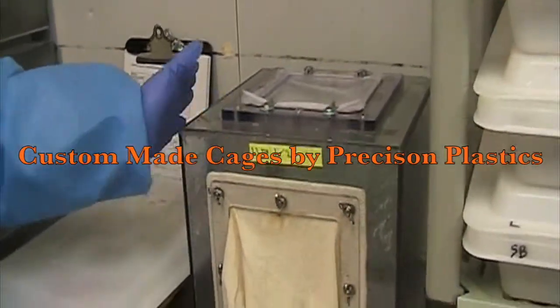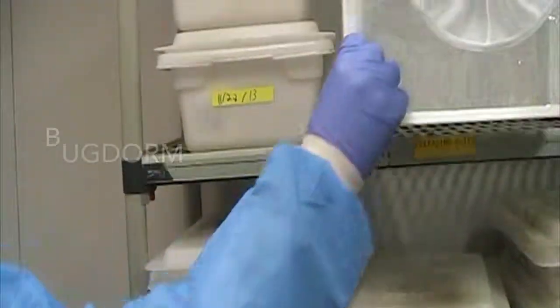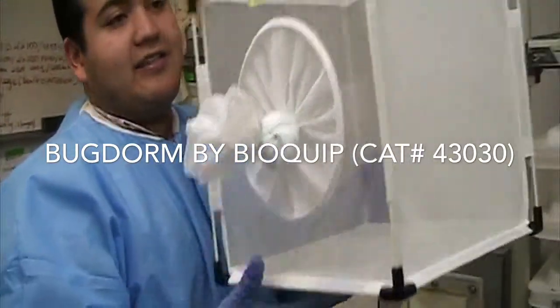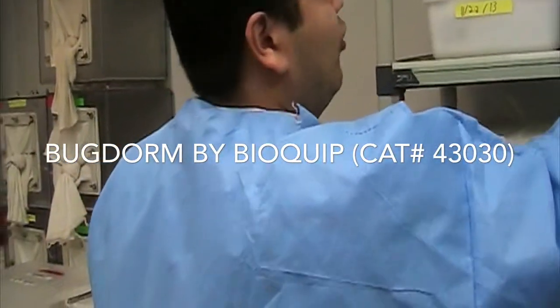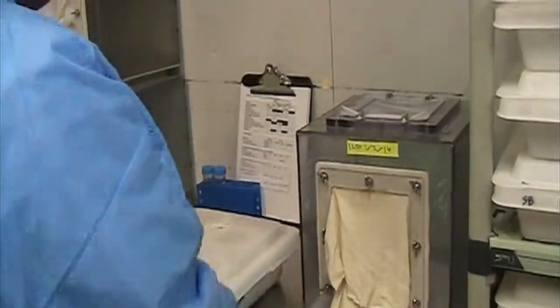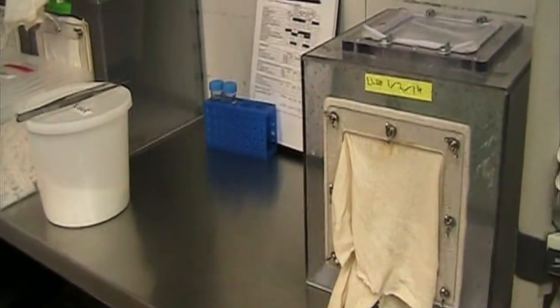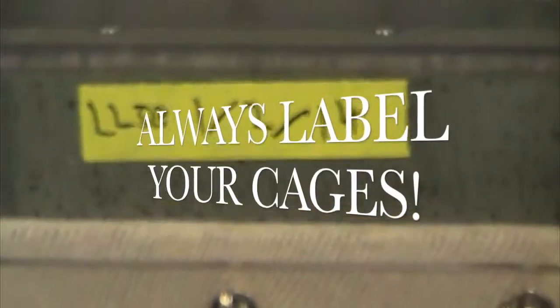This is a regular plexiglass cage that we use. If you can't afford a cage like this, there is a cage available called a dorm cage — it's the exact same thing. After you finish releasing, you always put the date on the cage: you put the colony code and today's date.